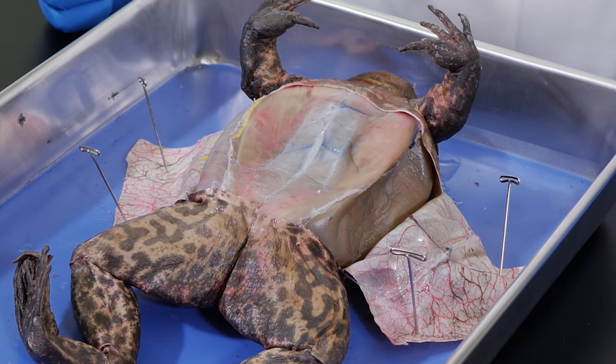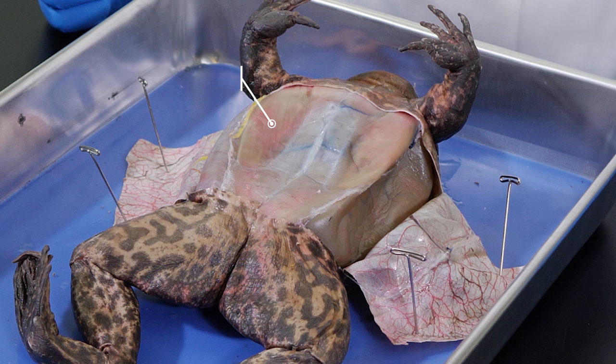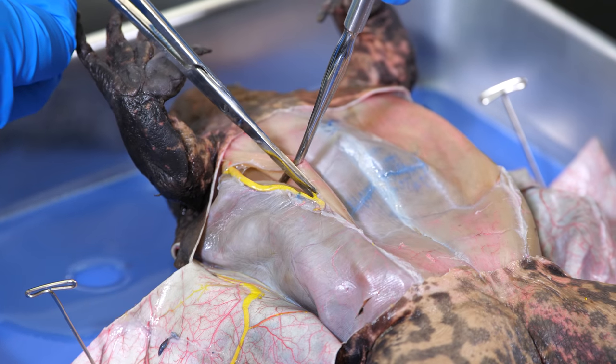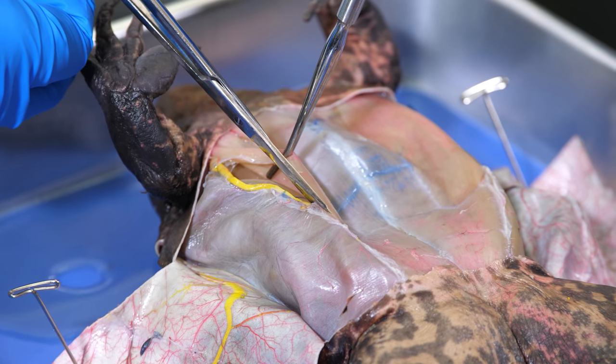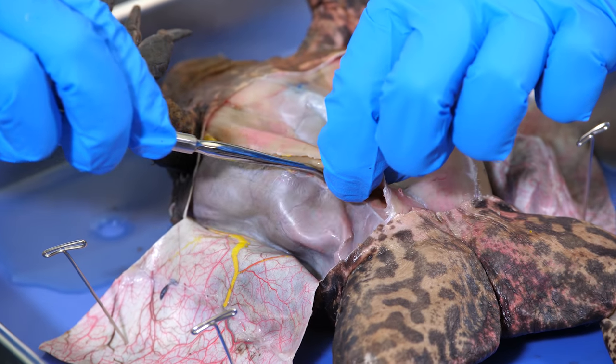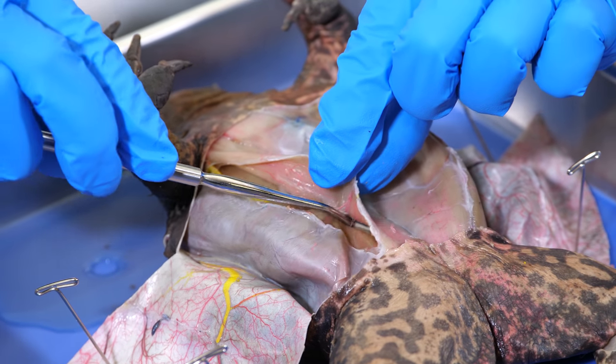With the skin pulled back, we can clearly see the muscle layer covering the frog's body cavity. These are skeletal muscles, which are sometimes called voluntary muscles. The frog's skeletal muscles are similar to our skeletal muscles in function, but the size and arrangement of its muscles are different. We use the scissors to make a lateral incision through the muscles, and we must be especially careful not to damage underlying organs. The muscles are loosely attached to the organs below with mesentery tissue. With our blunt probe, we can loosen the mesentery to separate the muscles from the organs.